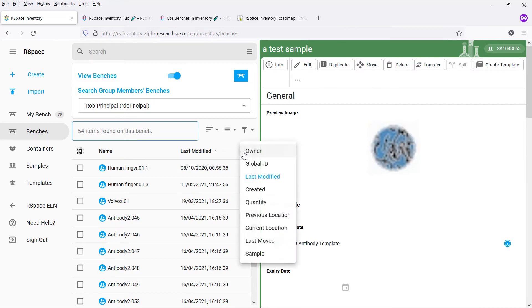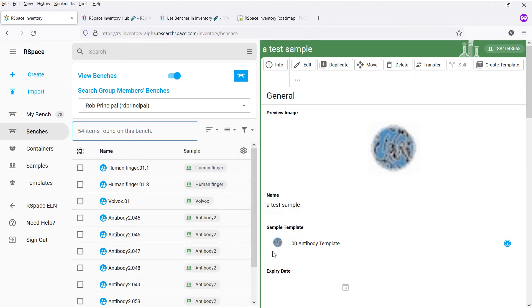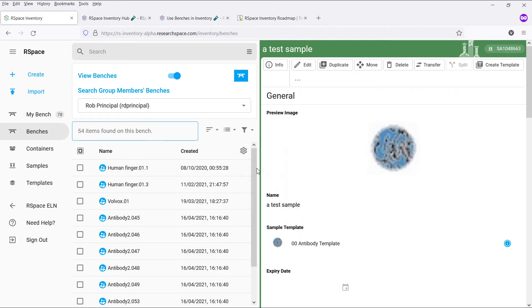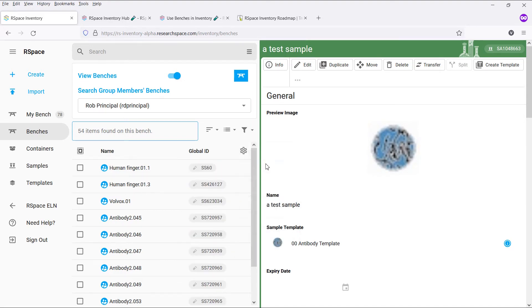By clicking on the gear icon on the right of the column, you can select what item property you would like to display in this column. This is very useful when you want to quickly find an item based on the value of a specific property, or perhaps compare this value across several items.